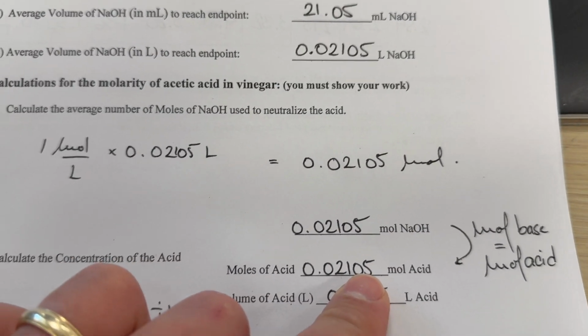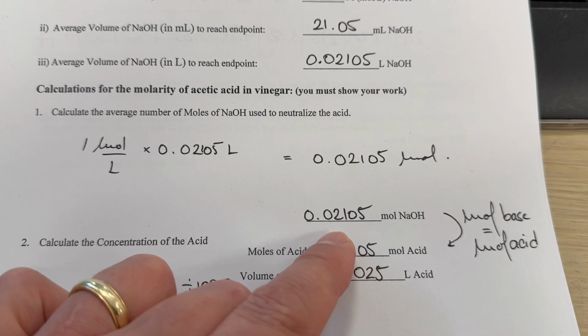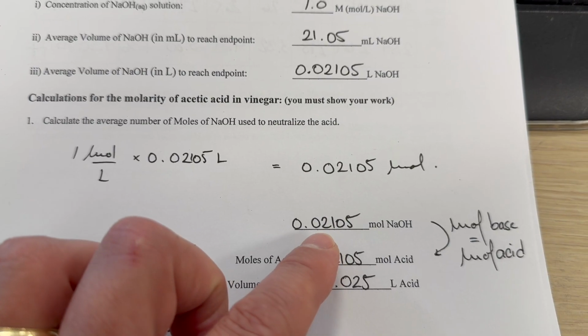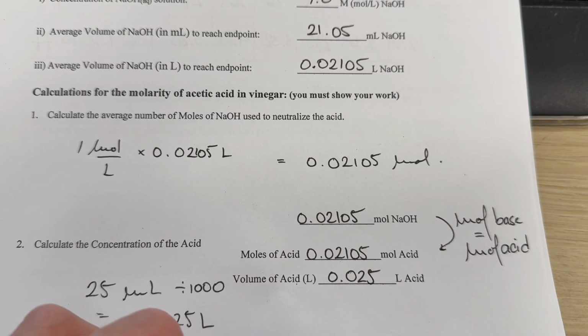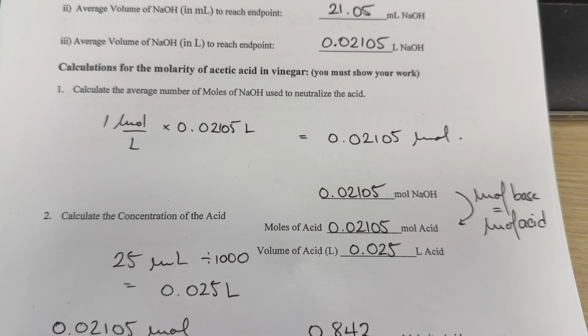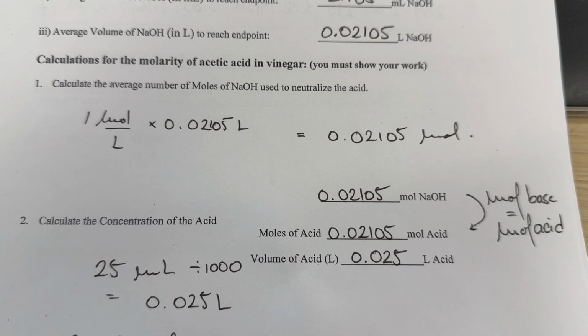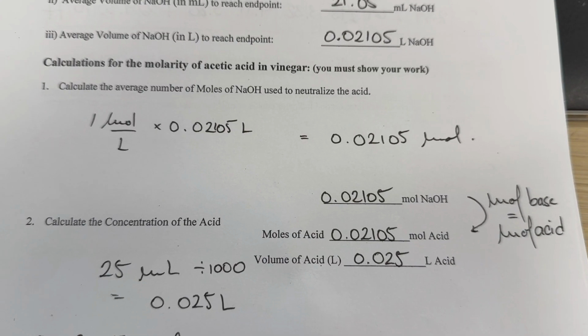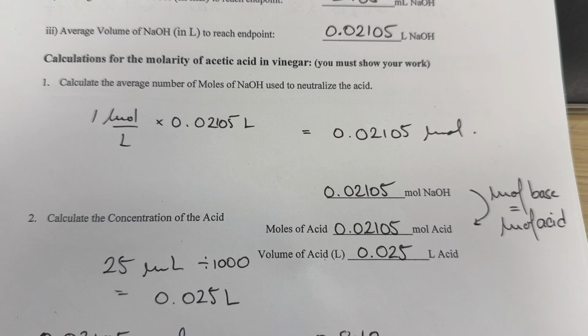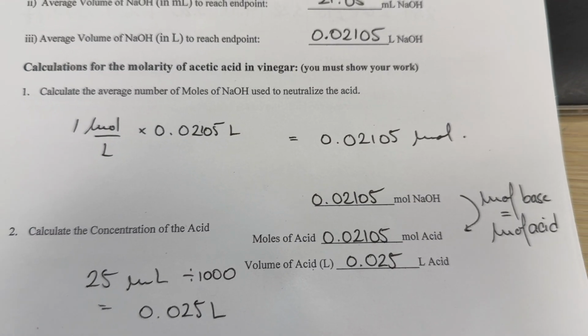These are the moles of base, and this is an important number because at the equivalence point, the moles of base are equal to the moles of the acid. And so we know that if we put in 0.021 moles of base, it's because there were 0.021 moles of acid.